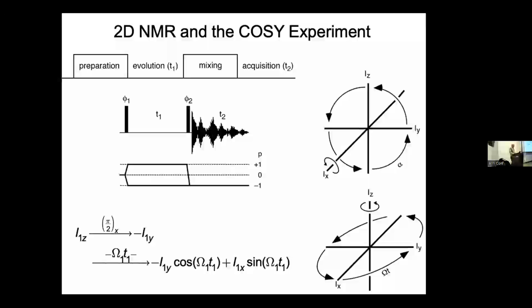And I'm only going to pretend that I'm starting with I1, even though it's a non-selective pulse, just to save writing. And at the end, I can figure out what happened to spin I2 just by swapping all the labels, since it's non-selective pulses on the homonuclear spin system. Otherwise, I have a lot more writing to do, and it just doesn't fit on the slides.